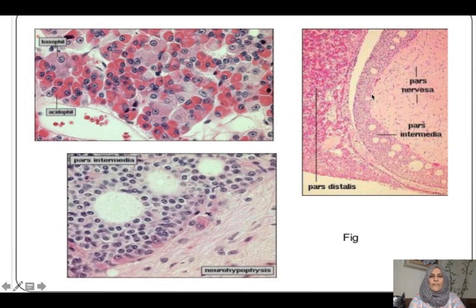نرجع على هذه البيكتشر الموجودة، السلايد اللي موجود، هذا under low power of magnification، وهذا عندك هنا under high power of magnification بعد clusters of the glands. مثل ما معودتك بالأنسجة، أنا يهمني كلش تعرف أنه يعني من أجي أسألك على histology of the pituitary gland you should know what are the cellular structure of it، يعني شنو cells of the pituitary gland. فهسه من راح نيجي على anterior pituitary gland.